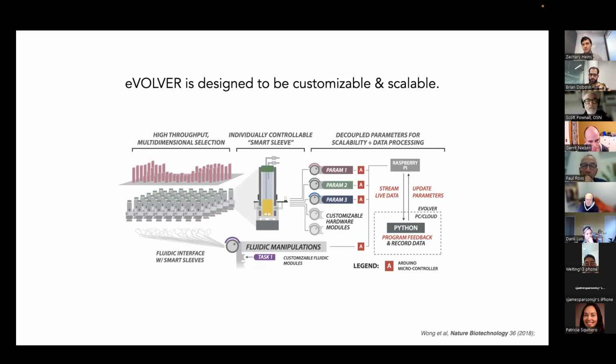The point is we want to get this hardware into the hands of the people who have creative biological experiments and ideas who are otherwise limited by technical capability. Getting them a tool that's easy to use was the idea. So everything is in Python for that reason, to make it simple. There's libraries provided so that you don't have to write any low-level code. You can just say fluidics, send pump for 5 seconds to this vial, and it'll do it.